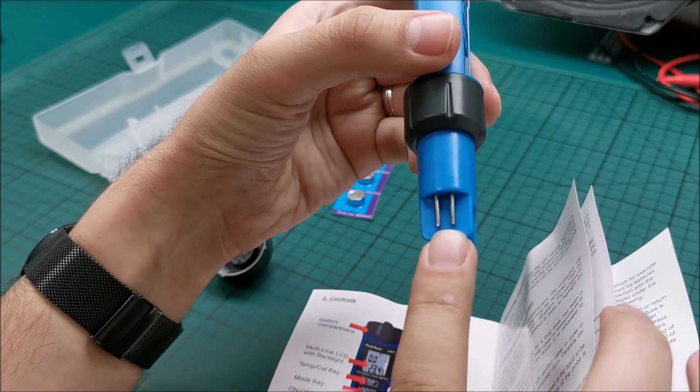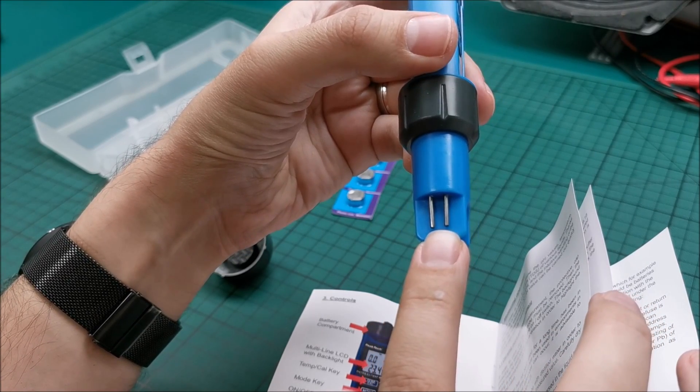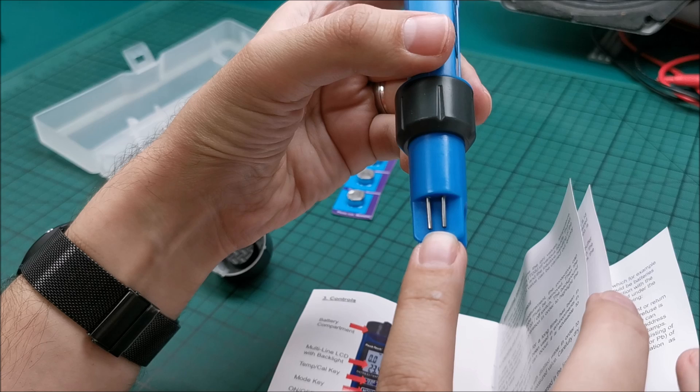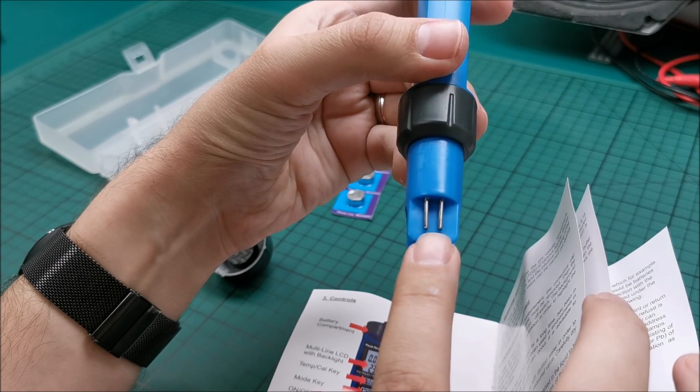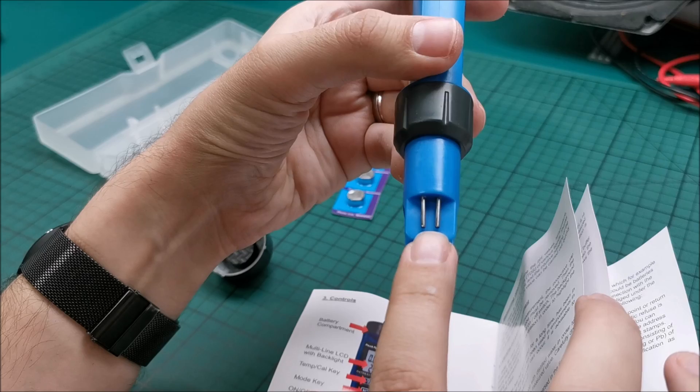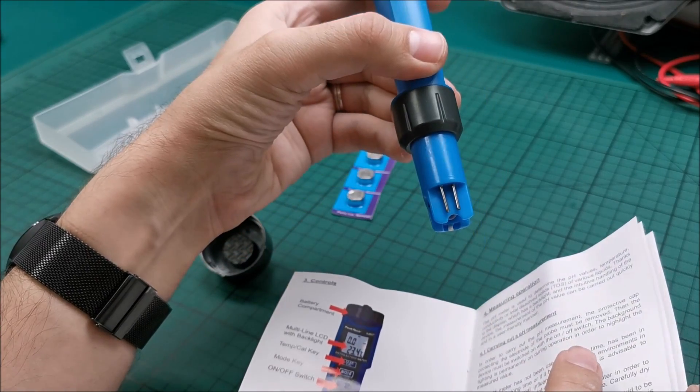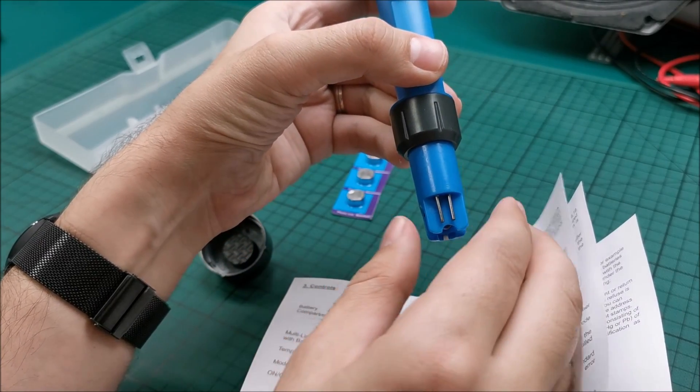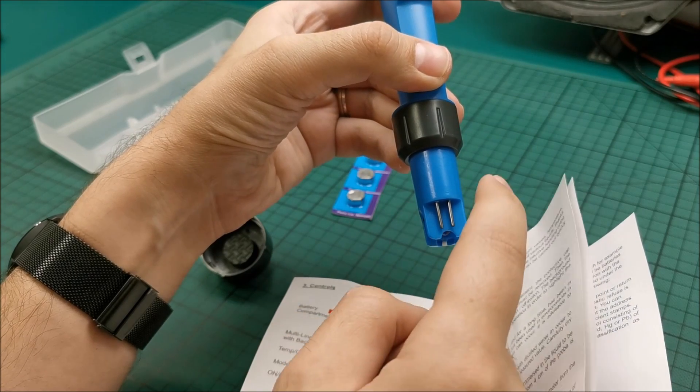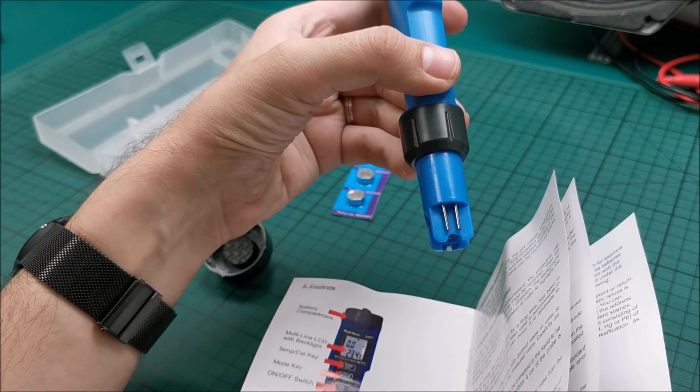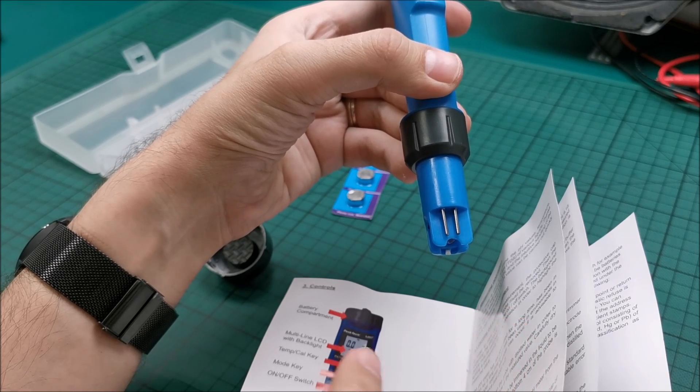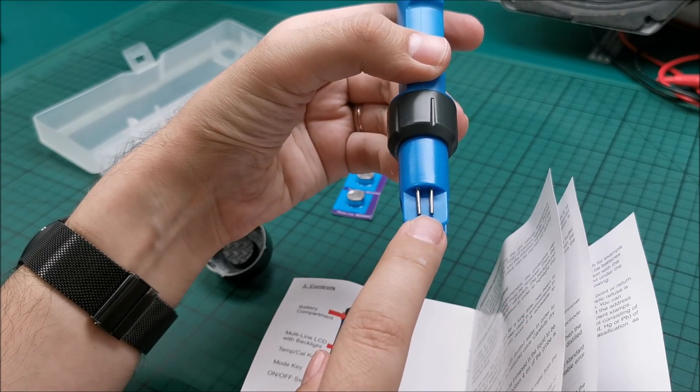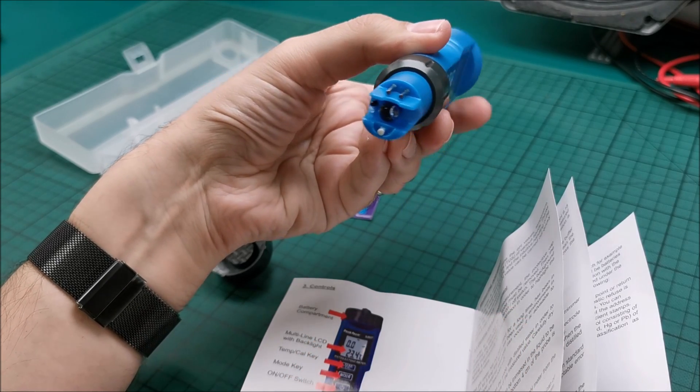This might be used to measure the conductivity of a certain liquid. If you look inside your washer fluid in your car for example, you will see two electrodes. And the car knows based on if the electrodes are submerged or not if you still have liquid. When they are not submerged anymore, they don't conduct and hey, you get a notification. I think also in your coolant you have two electrodes. So I think these are used for conductivity measurement.